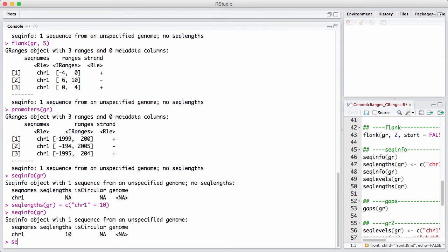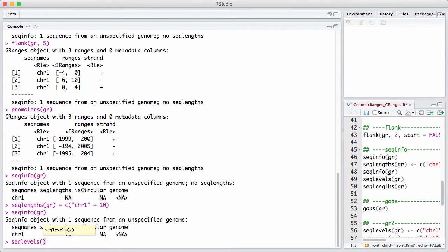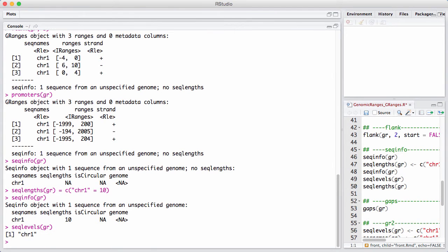We can see the different chromosome names, which are given by sequence levels.